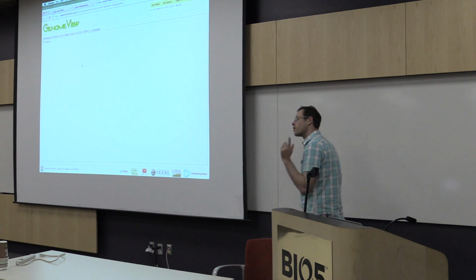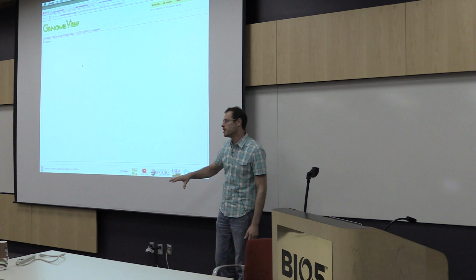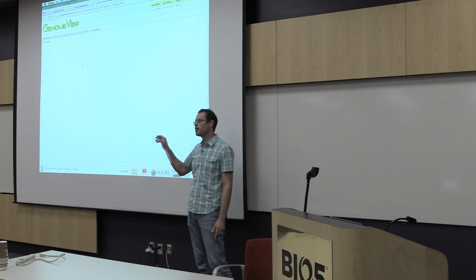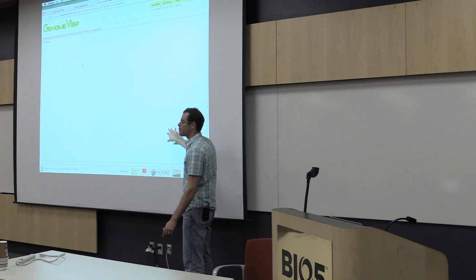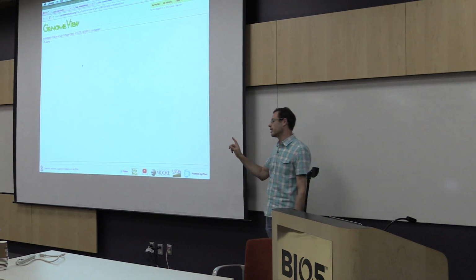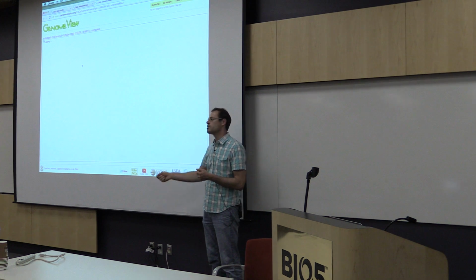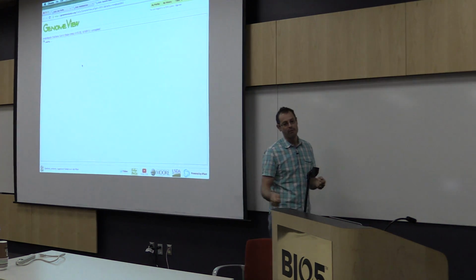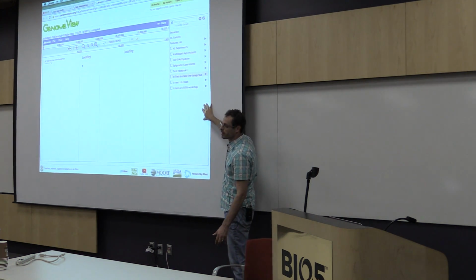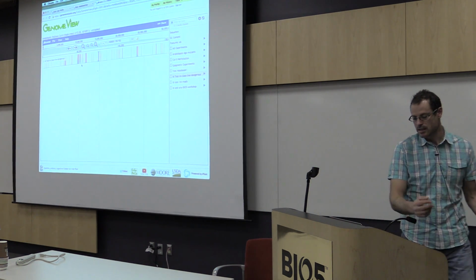Now, since I mapped it to Arabidopsis, this is going to take a few moments to load. The reason being is that Arabidopsis right now has 1,300 functional experiments mapped against it. And so what it's doing right now, and we realize that this is a little bit of a bottleneck, is it's running through, and there's a lot of private data. And for every private data set, it has to check my credentials to see whether or not I have permission. Then it grabs all of those experiments and loads them into a table over here that I then can use to navigate and search through all of those data sets.